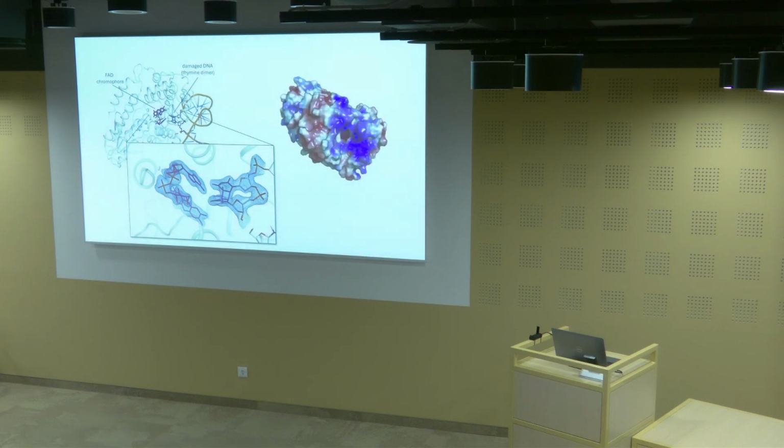Other notable features of the enzyme are that it's got this nice positively charged surface that's perfectly complementary for the DNA, and you can see the active site pocket here for the DNA double helix to nestle in perfectly, ready for action.